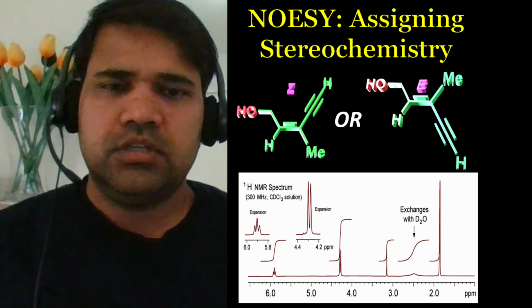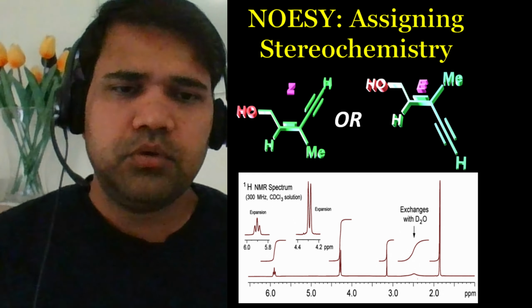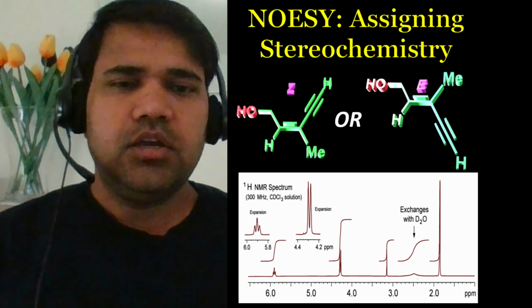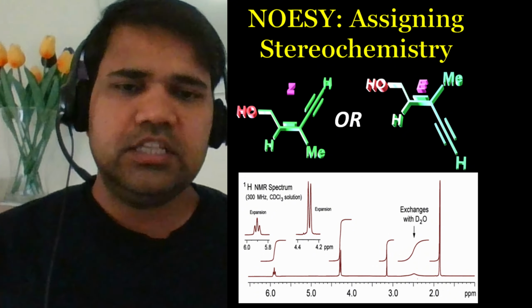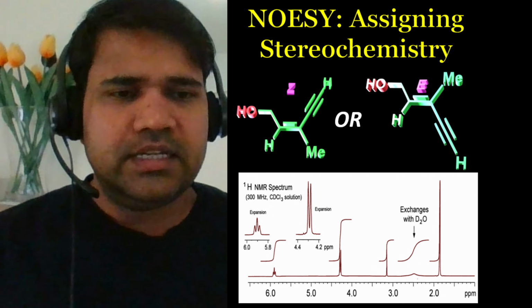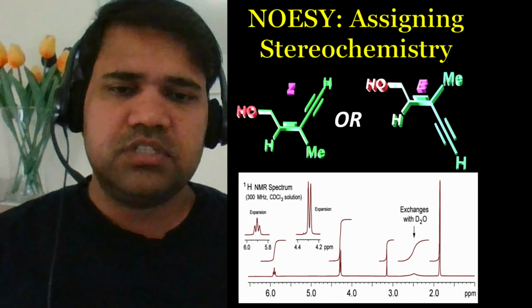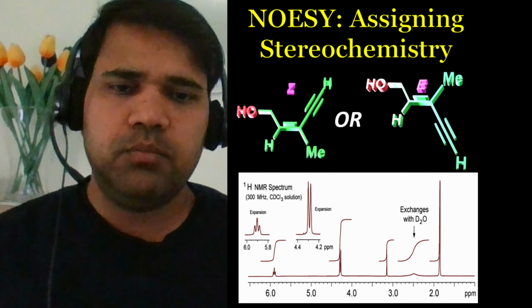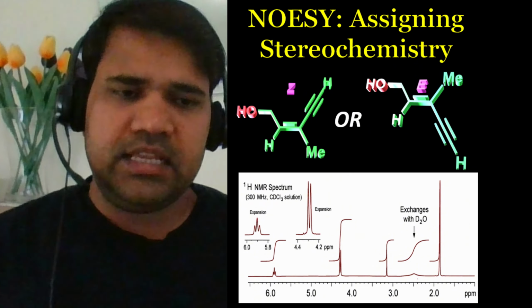So how do chemists solve the stereochemical mystery? The answer lies in 2D NMR techniques, particularly COSY and NOESY NMR. At first glance, you might think COSY NMR should be able to distinguish between these two isomers. However, in this particular case, COSY fails completely. Why? Because COSY only tells us which protons are connected through bonds. It gives mainly vicinal cross coupling, and you can see the 4-bond coupling as well, but those will be weak, and therefore the information is identical for both the E and Z isomers.